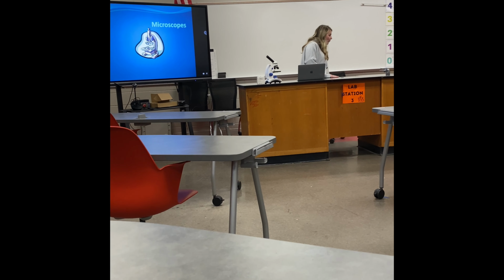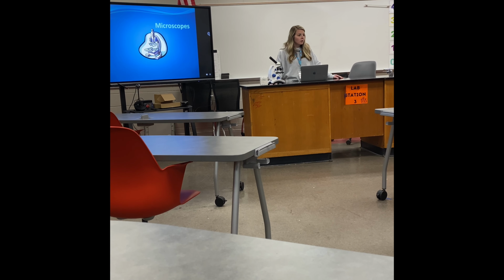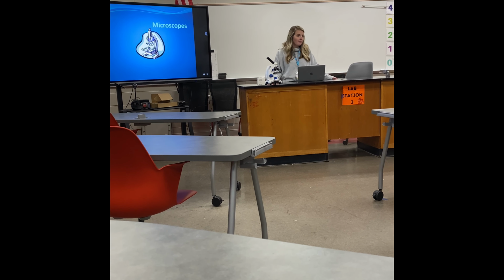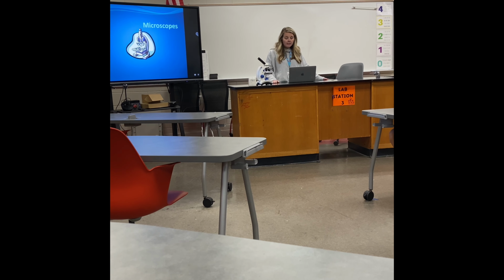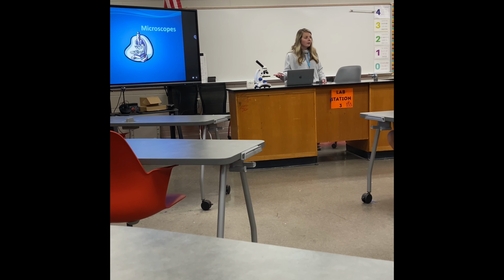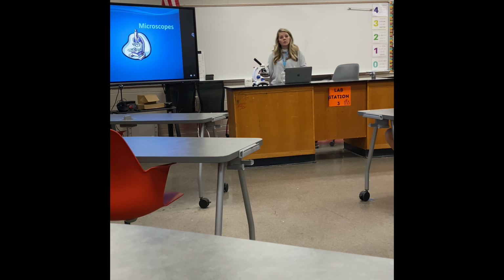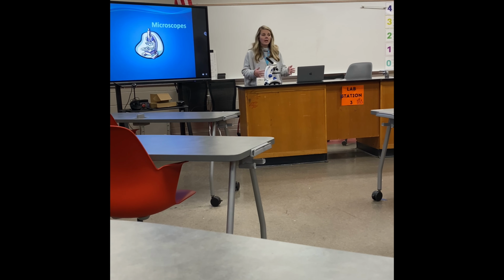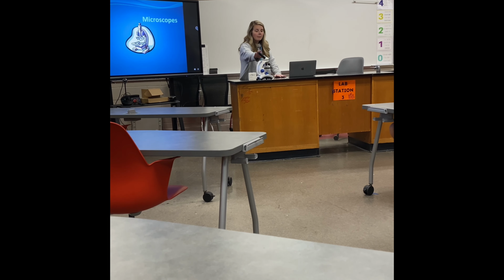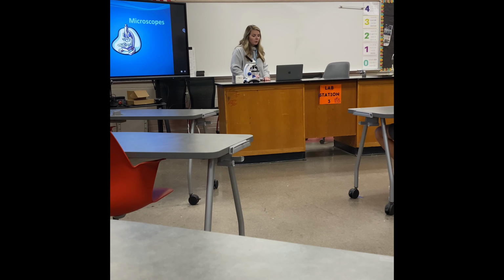Okay, so today we are going to be covering the microscope, and we're going to learn a little bit about what we do with the microscope, why it's important, why we use it in science, and a little bit of history about it. So our objectives for today: you should be able to effectively use a compound microscope to identify specimens, specifically cells. That's going to be what we move into next, different types of cells. You're also going to be able to identify the parts of the microscope, so to know their function and what they do. That's really important.